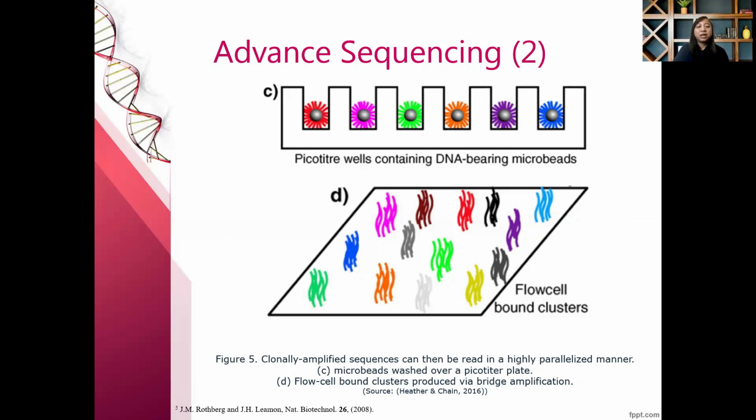Each bead is then placed in a single well of a slide. So, each well will contain a single bead covered in many PCR copies of a single sequence. The wells also contain DNA polymerase and sequencing buffer.